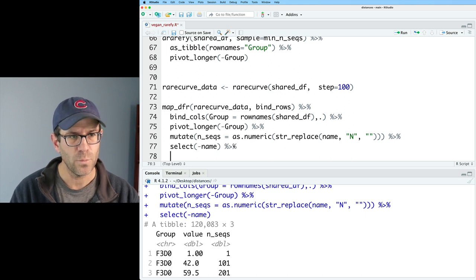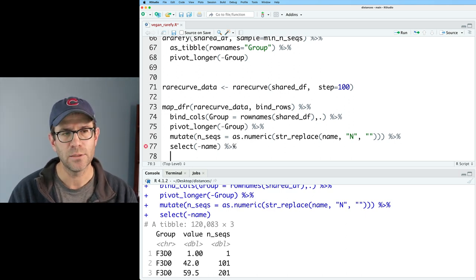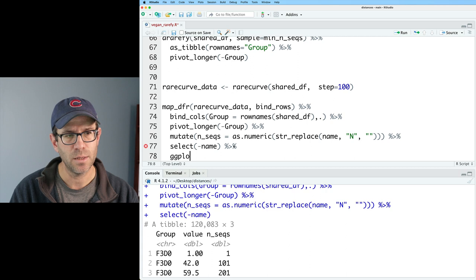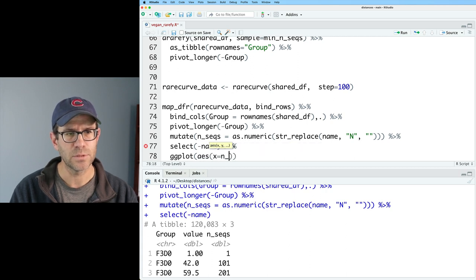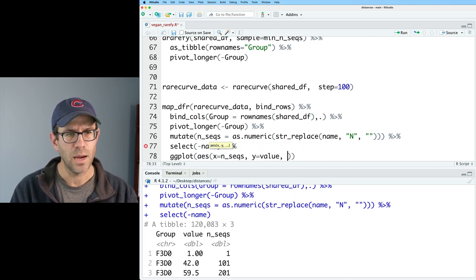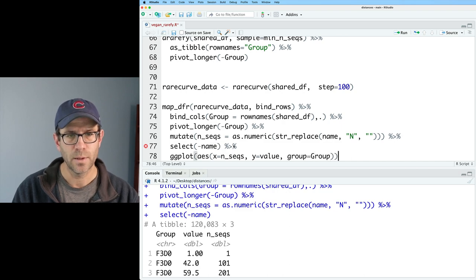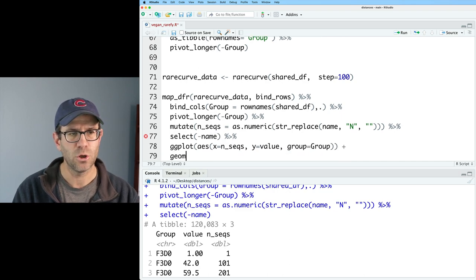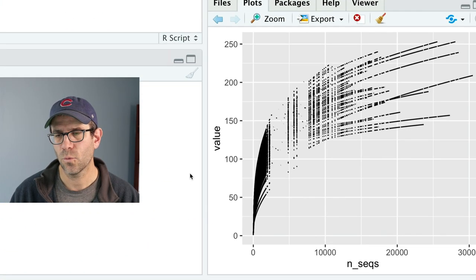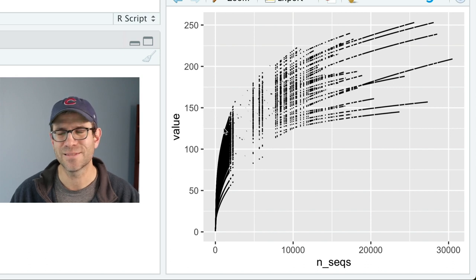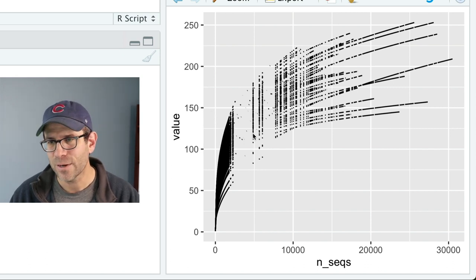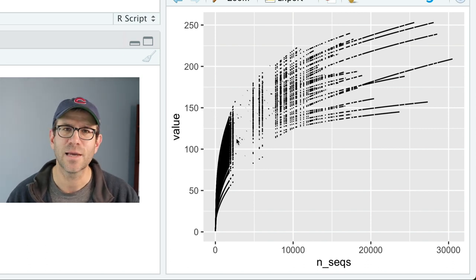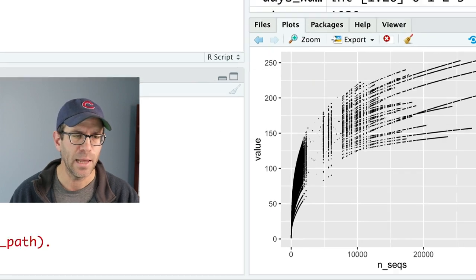The name column isn't causing any problem, but let's get rid of that. And now what we can do is we can go ahead and do ggplot, aes, x equals nseqs, y equals value, and we'll do group equals group, and we'll do a geom_line. And looking at our figure, we get some really funky output here. It almost looks like I use geom_point rather than geom_line.